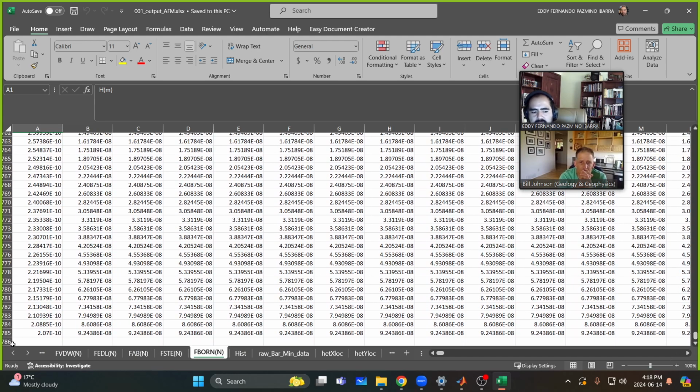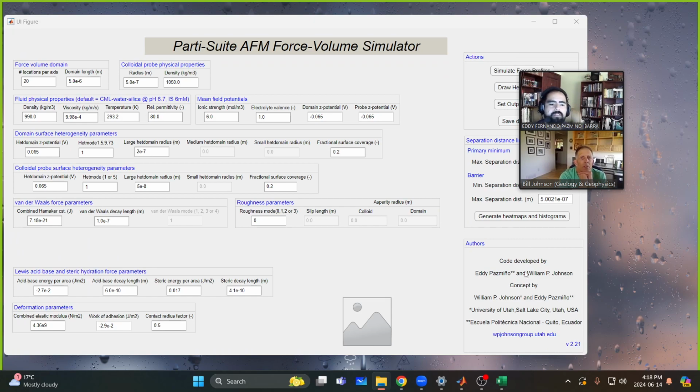The closest we go is like 2 angstroms, 0.2 nanometers, and that is a really strong colloidal repulsion there, as you can see. It's pretty much the same everywhere because Born is independent of surface charge heterogeneity, and all these first principles are built up in the model.